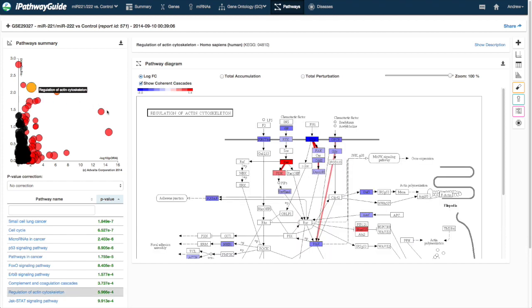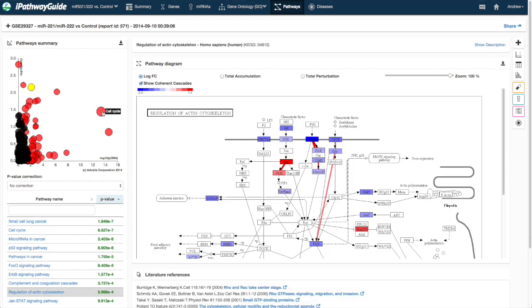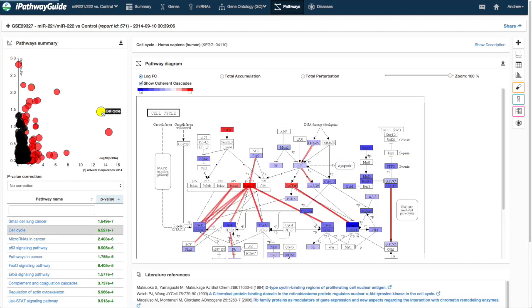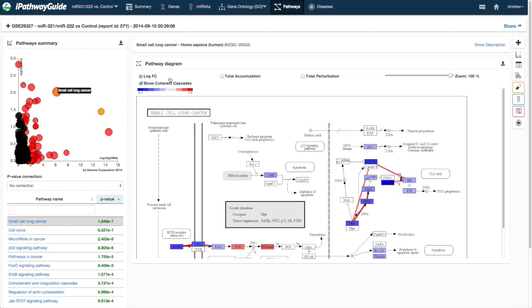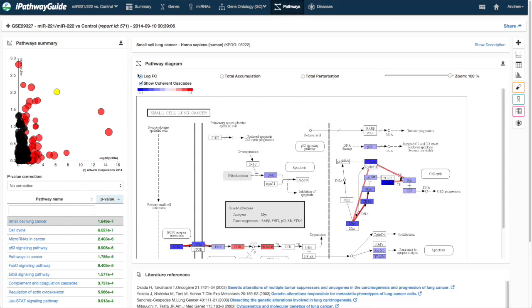In the Pathway Diagram section, the selected pathway image from KEGG is displayed. By default, the measured log fold change of the significant differentially expressed genes is displayed.